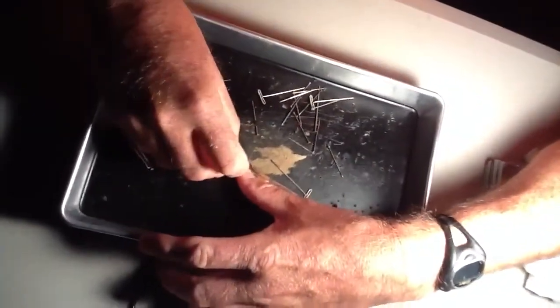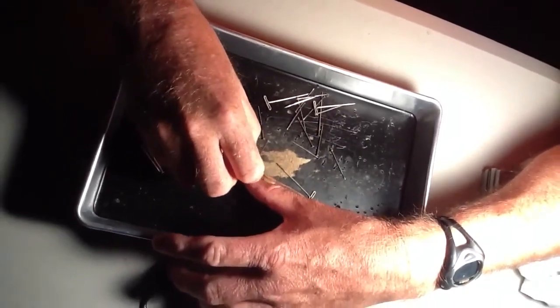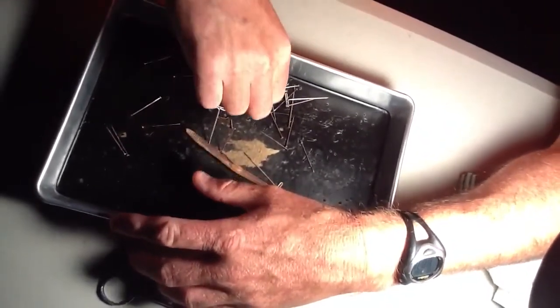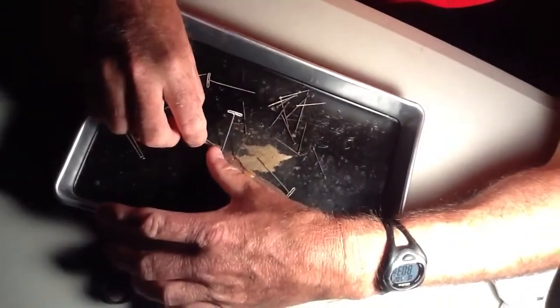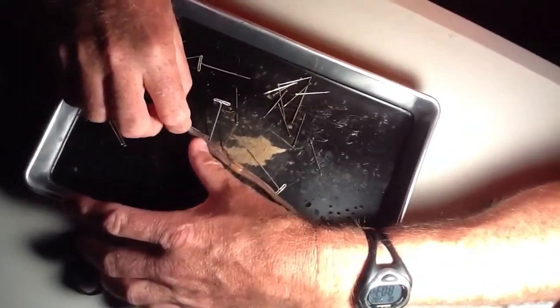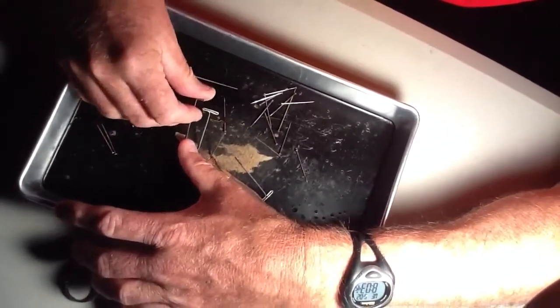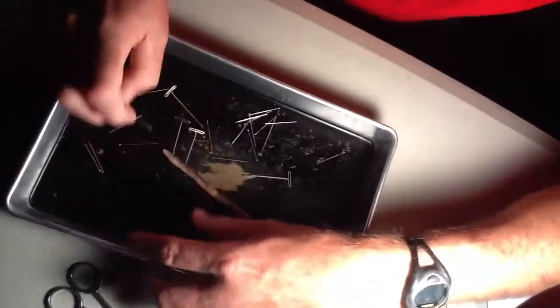scrape it so that the skin opens up. So I kind of just scrape. When I get far enough, I'll put another pin in. Take another pin, try to get so you guys can see. Scrape it all the way up to that point, put another pin in. Get that pin out of the way.